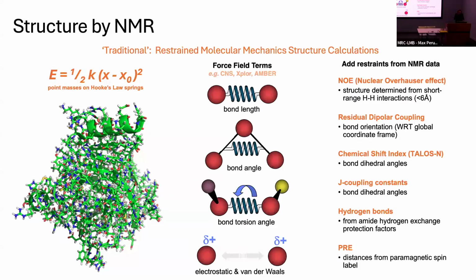And then what we want to do in silico is reconcile all of these restraints with a folded structure, to make sure that in the final structure you don't have any violations. The structure doesn't counteract any of these restraints that you've given the system.